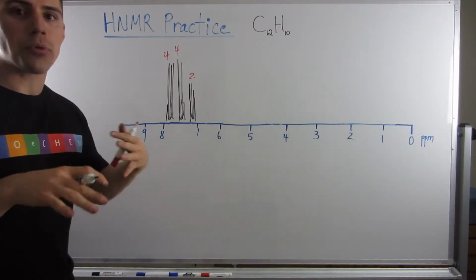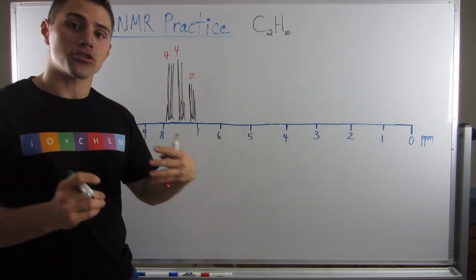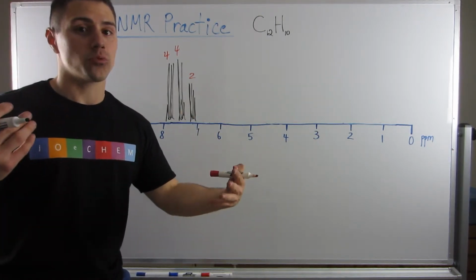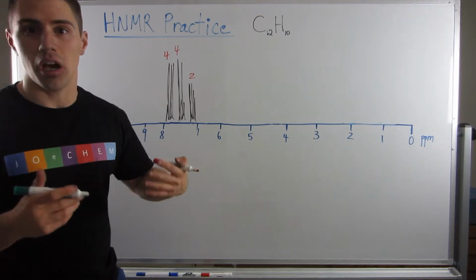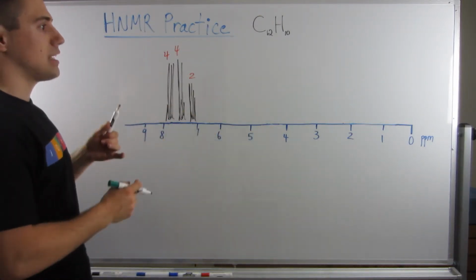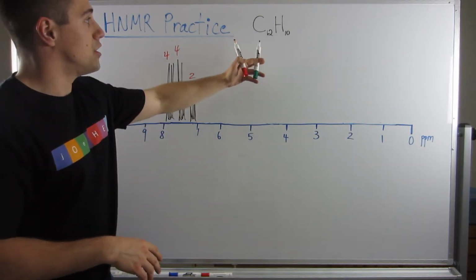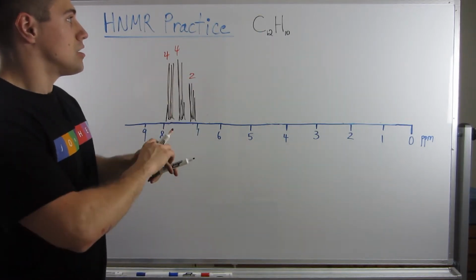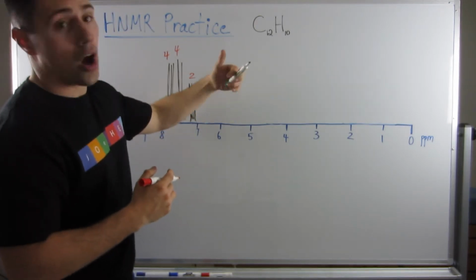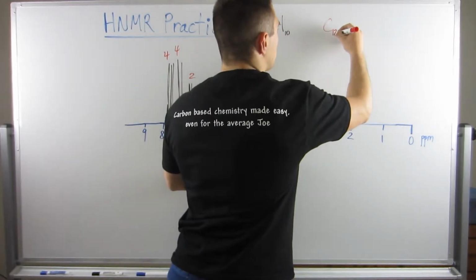Okay, so this problem is going to be a little bit different from NMR problems you may encounter when you're first starting out your career, but I wanted to show you this for symmetry purposes as well as getting you some exposure to other things as well. Okay, so we're extremely downfield just upon glancing at our spectrum, but no fear, let's trust our process and get after it. Okay, so let's figure out our degrees of unsaturation. So we don't have to really apply the formula here because we don't have too much going on as far as non-carbon, non-hydrogen atoms.